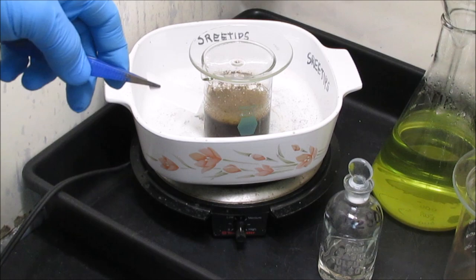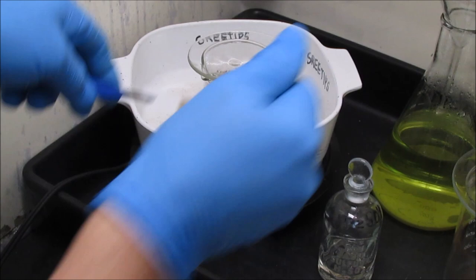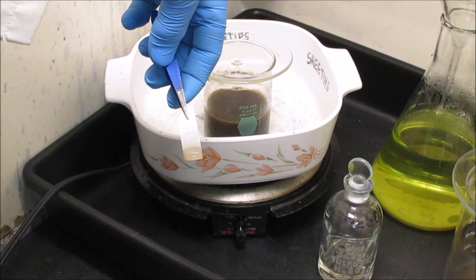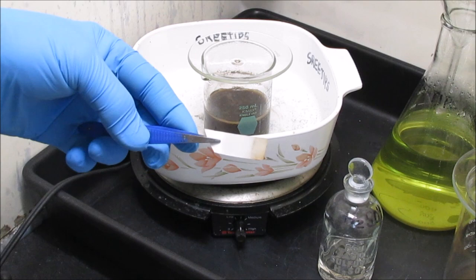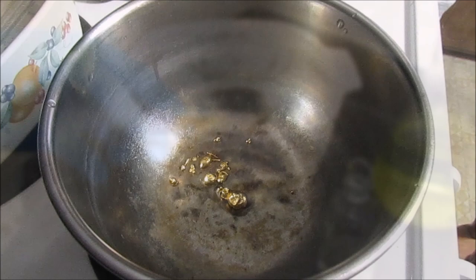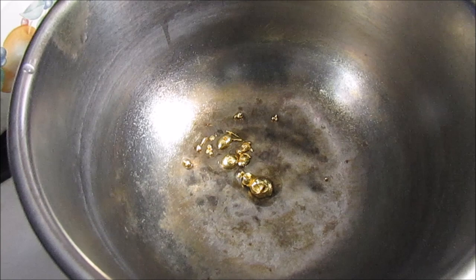Do a quick stannous test on this residue that I've got boiling back here. See what we got. Yeah, it doesn't look like a whole bunch. It's not a real dark reaction. So I'd say less than a tenth in there. I've rinsed the gold off real good with some fresh tap water, and I've got it on the stove here drying off. As soon as it gets dried off, we'll get a weight on it and get a yield.